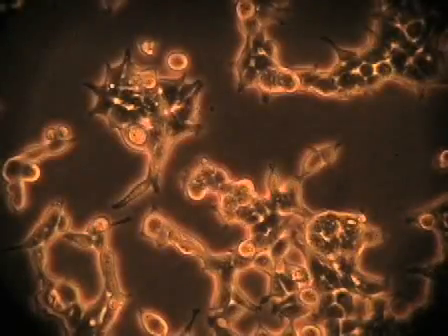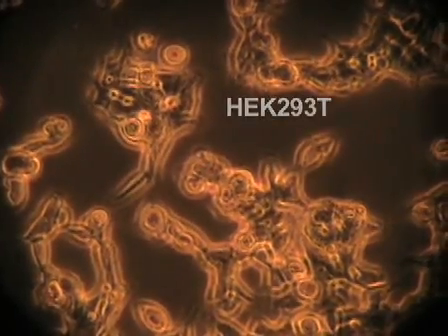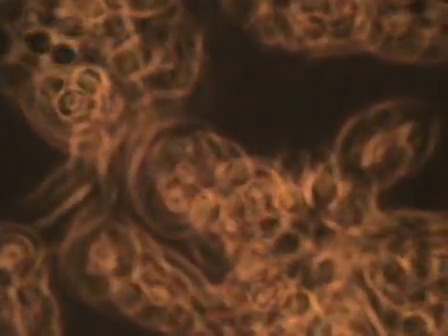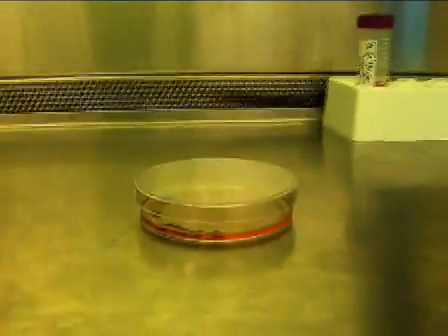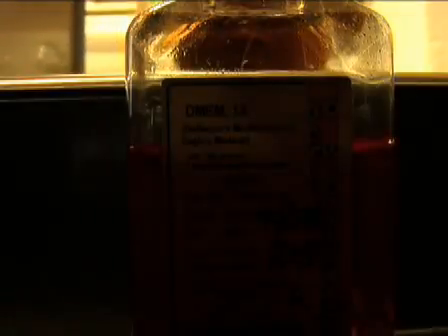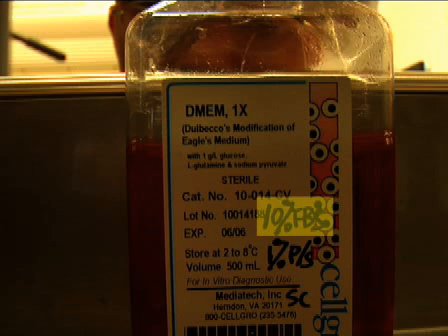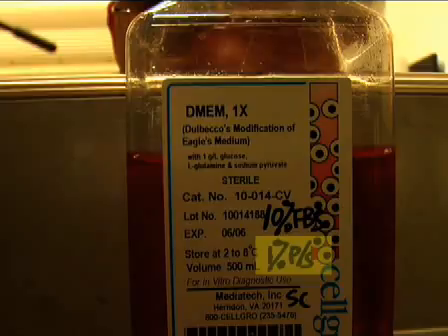For this procedure, we use cultures of human embryonic kidney 293 cells. These cells are grown in 10 cm culture dishes in medium A, which consists of Dulbecco's modified Eagle's medium, or DMEM, supplemented with 10% fetal bovine serum, or FBS, and a cocktail of antibiotics.